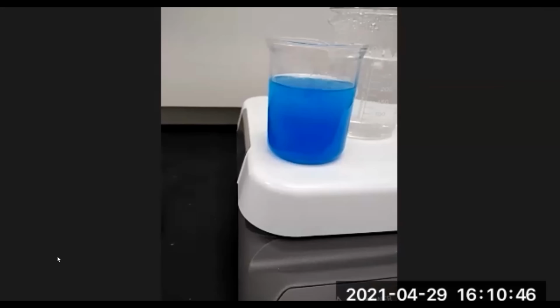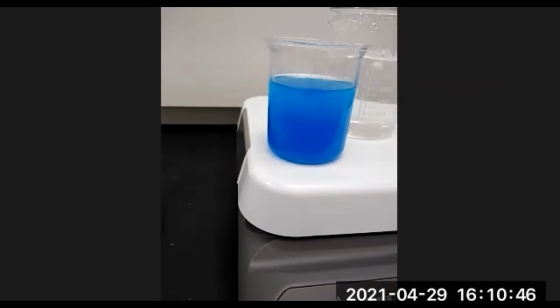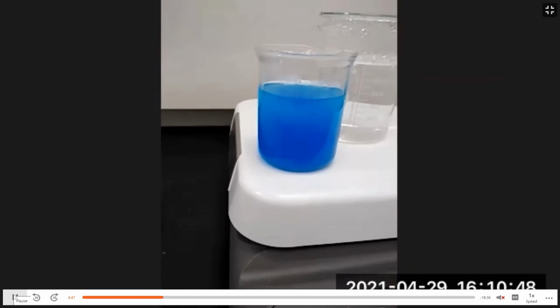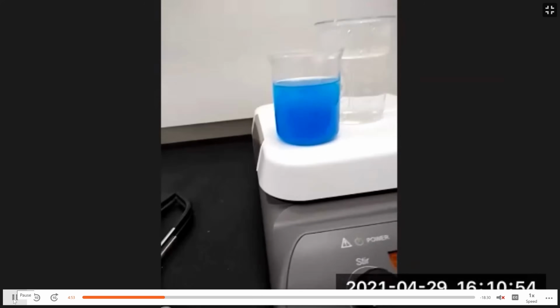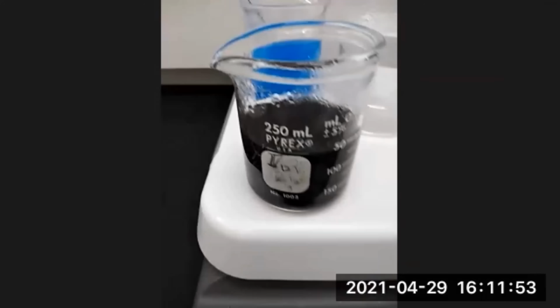So we're taking copper 2 hydroxide, we're heating it. It gets converted into copper 2 oxide, which is a black precipitate. So you want to make sure all of it has been decomposed into copper 2 oxide before you move on to the next step. And so over time, it turns to a black precipitate. So after 10, 15, 20 minutes, we get this black precipitate, which is the copper 2 oxide. So now we've done the decomposition reaction.